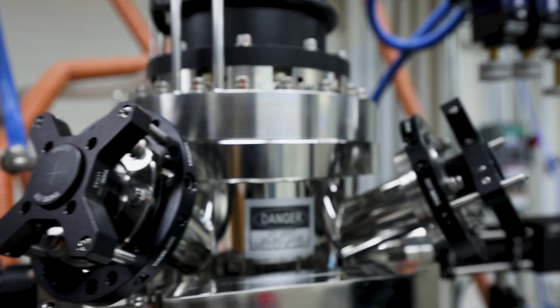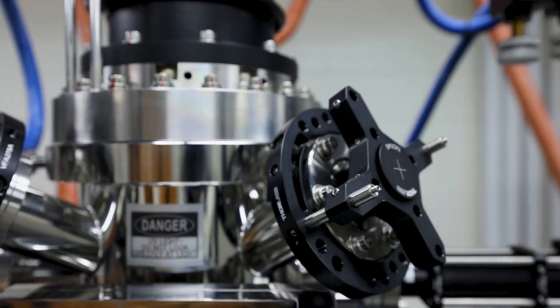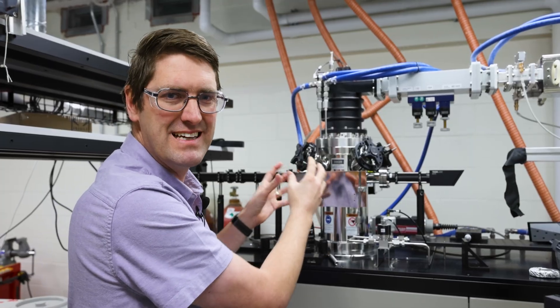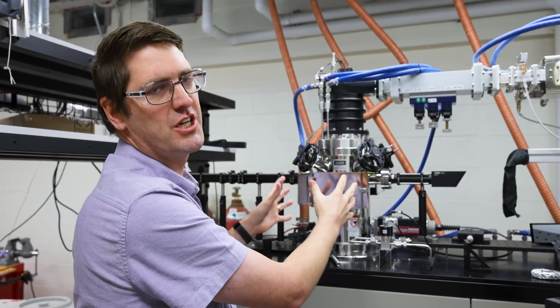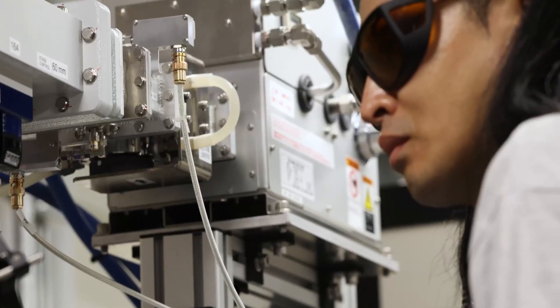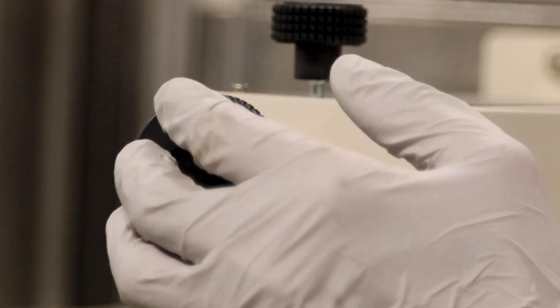The reason we've got a third machine here is we really need to understand the details of what's happening inside that plasma. This machine is configured very nicely for us to be able to peer inside the plasma with the diagnostic tools that we have available, to look at the plasma, understand the plasma, and use that to make better diamond.